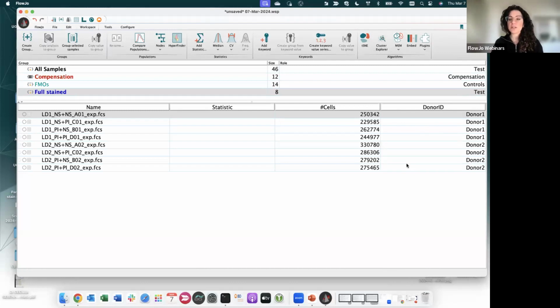And you can go on with these keywords for your time point, for your condition of stimulation, and so on. I strongly recommend you set your workspace the best way possible, because this will streamline your analysis at the end, and you can create a really full report, which is ordered, neat, clean, and really nice to show.